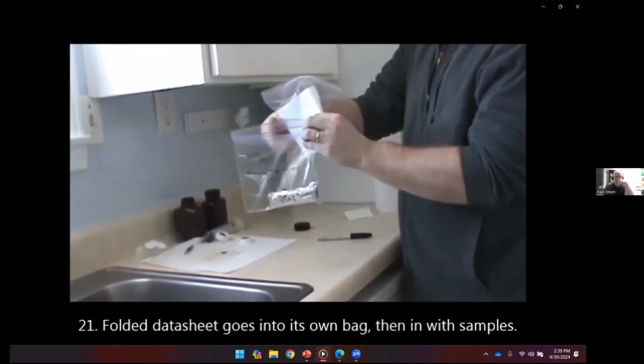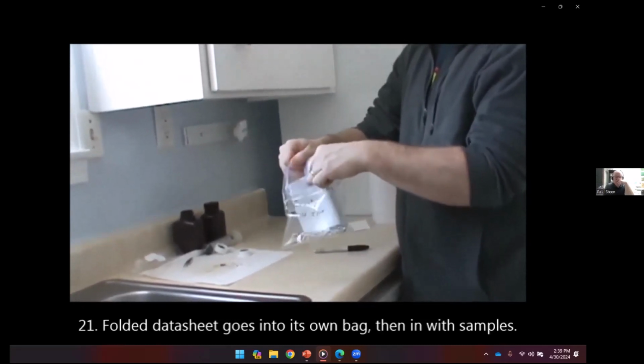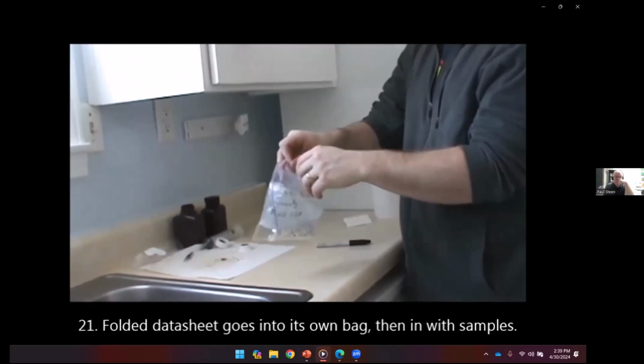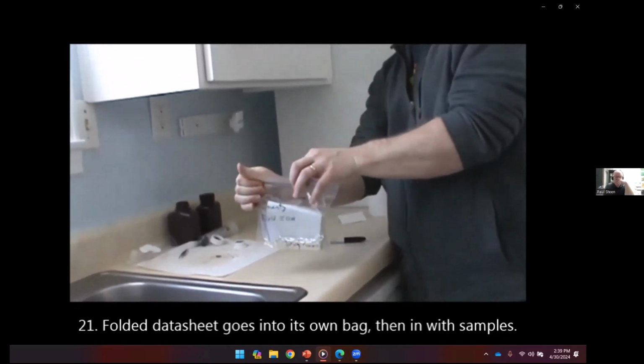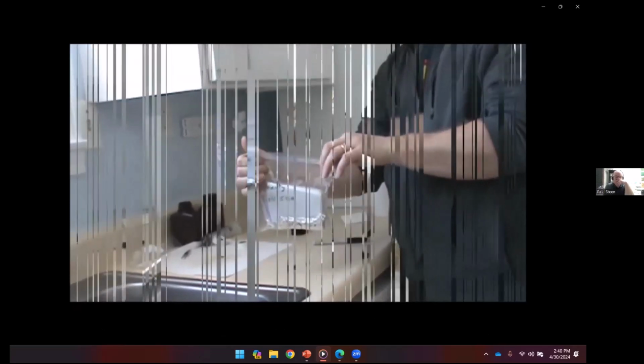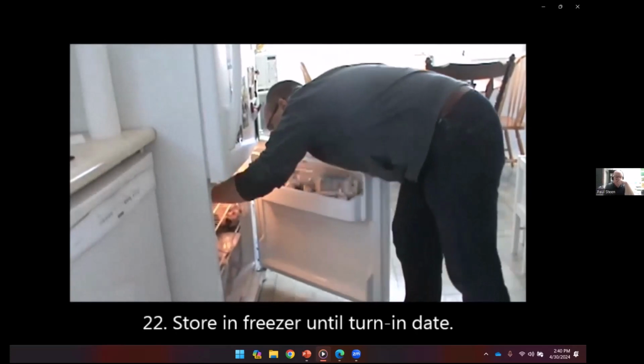Fold the datasheet, place it into a separate Ziploc bag so it stays dry, and place it in the bag with your samples. Storing your data sheet with the samples is a good way to make sure the paperwork never gets lost. And then everything goes into the freezer until it is time to turn it in.